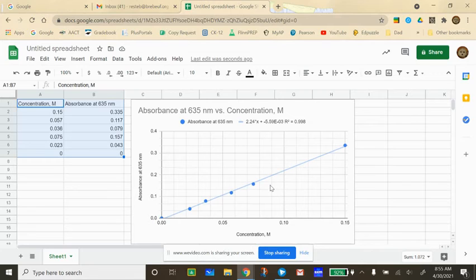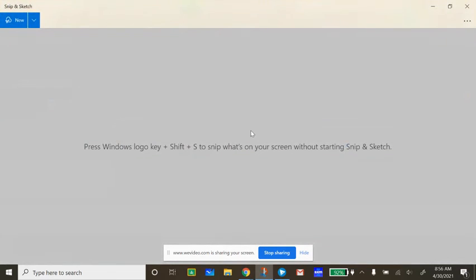That's what the trend line is. And how well these straight lines fit the data is what your r² value is going to help you determine. The last part is looking at the unknown concentration. You can use that trend line to predict the concentration of any unknown solution once you know the absorbance.